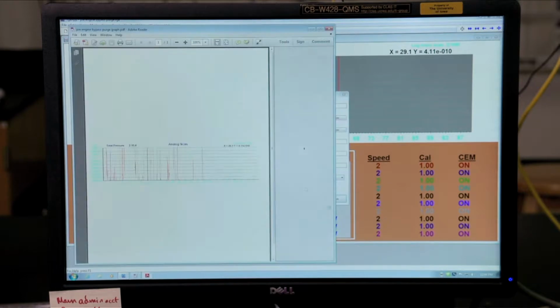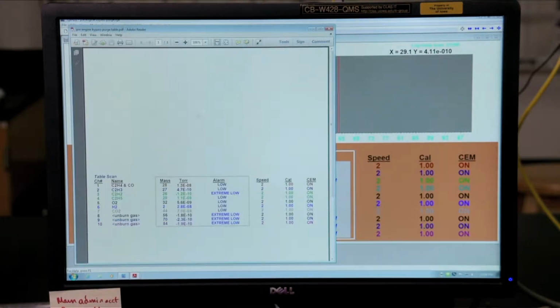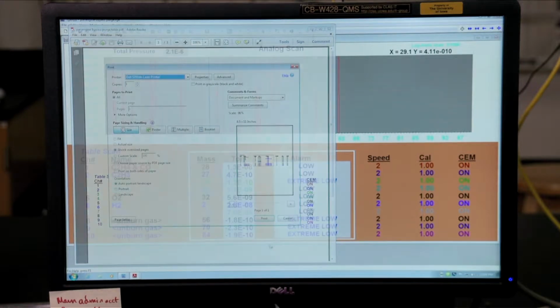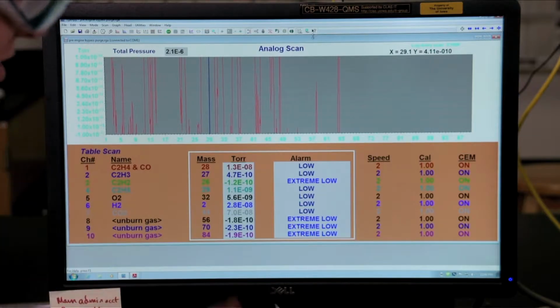and save it. And then the second dialog box that comes up will be the table, and this is what you need to print. So they'll save it as the same title, and then table, save that, save it again, and then when it comes up, you will want to go to File, and then Print to get this to come out. After you've saved, label your table with the total pressure from the instrument, and then the name of the experiment that you've just done. So pre-engine bypass purge for this one.